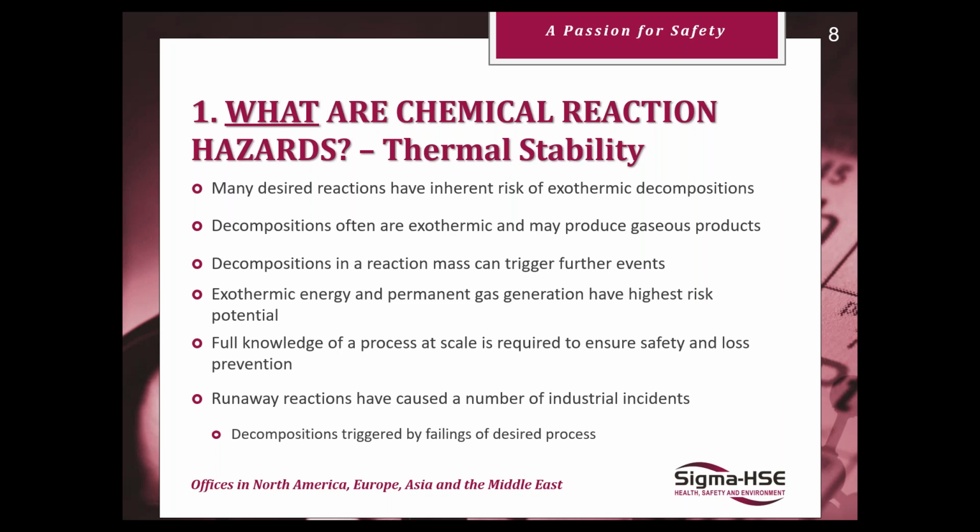So our decompositions often are exothermic and may also produce gaseous products. Decompositions will tend to produce the most stable compounds, which can often be gaseous. Decompositions in a reaction mass can also trigger further decompositions potentially, or produce toxic compounds which we'll want to control the release of.